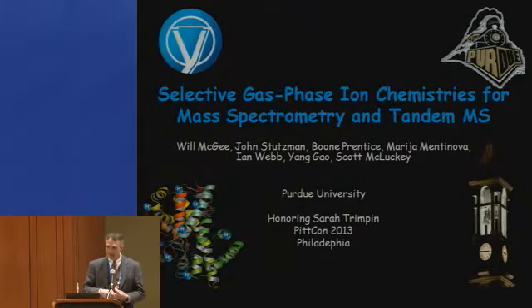A lot of it is really new. It's mostly not published. And maybe some speculative things in there, but the idea is we're looking at ion-ion reactions that will allow us to introduce more selectivity in the tandem mass spec experiment using very selective ion chemistries.